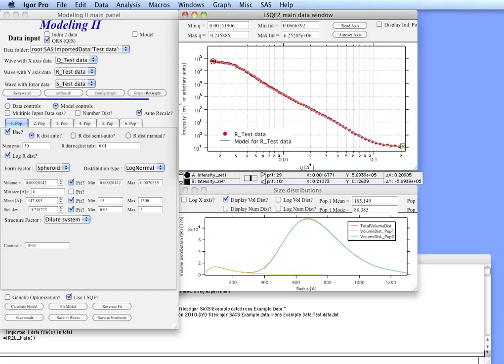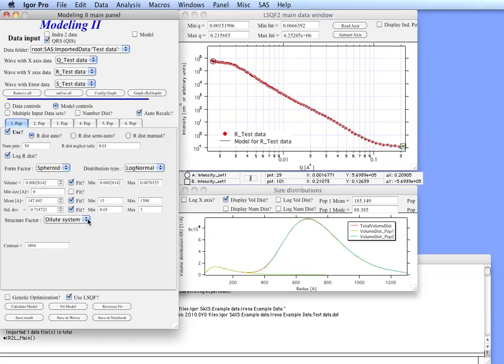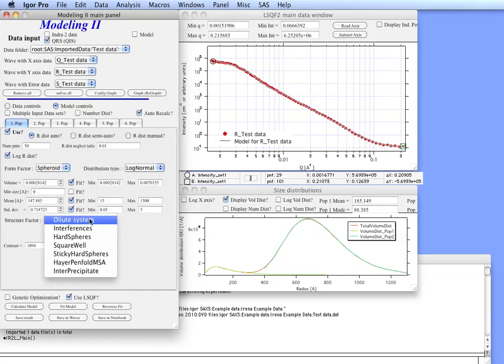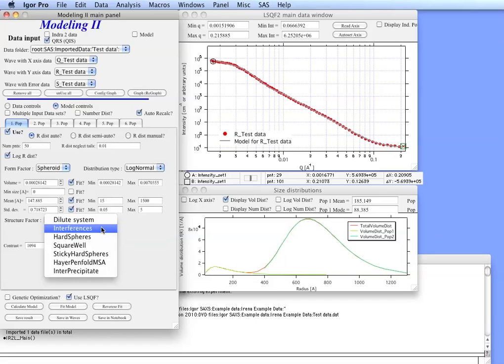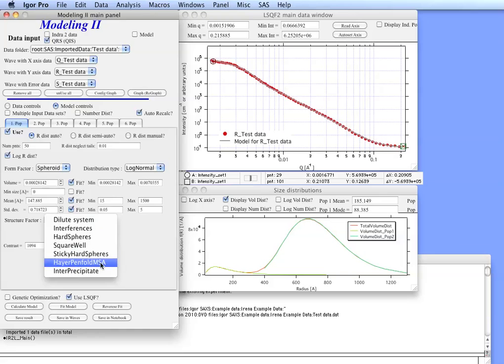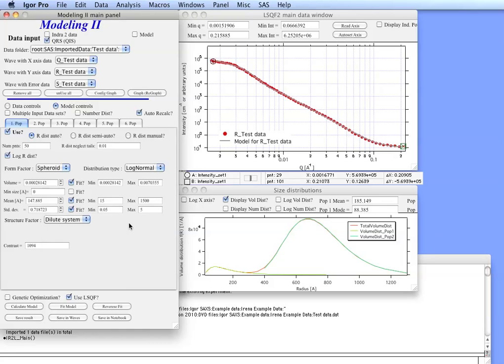The reason for that is really that these data here are influenced by interparticle interference, which is something we haven't tried to model because we used the simple system. You could in principle select here one of the interparticle interference parameters which are available and see if you can improve the fit. But realistically this is a compressed powder and the interference is going to be probably quite complicated. So there may not be a really good model for these things here anyway.